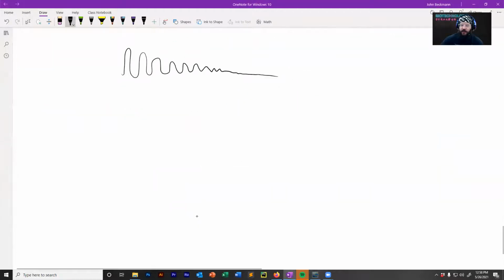So what we're sequencing here is a very, very small PCR product. The amplicon, what is it, like 500 base pairs? Something like 470. Okay, so that proves that you can at least get 470 base pair reads. So what we're sequencing is an amplicon.